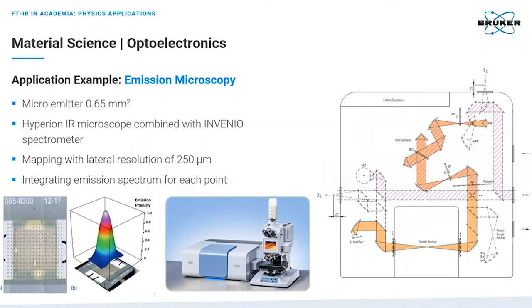Optoelectronics or optronics is the study and application of electronic devices and systems that source, detect, and control light, usually considered a subfield of photonics. One type of optoelectronic device is the electrical to optical transducer. As we looked at so far, all were bulk sources or at least macroscopic samples. A brand new and still developing topic is thermal emission spectroscopy on the microscopic scale.